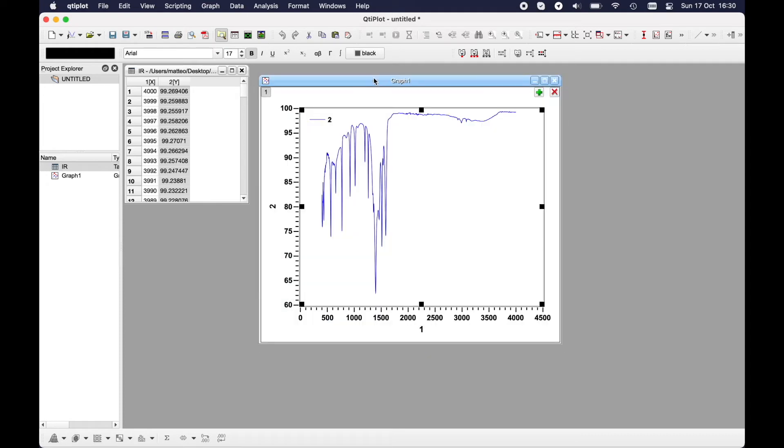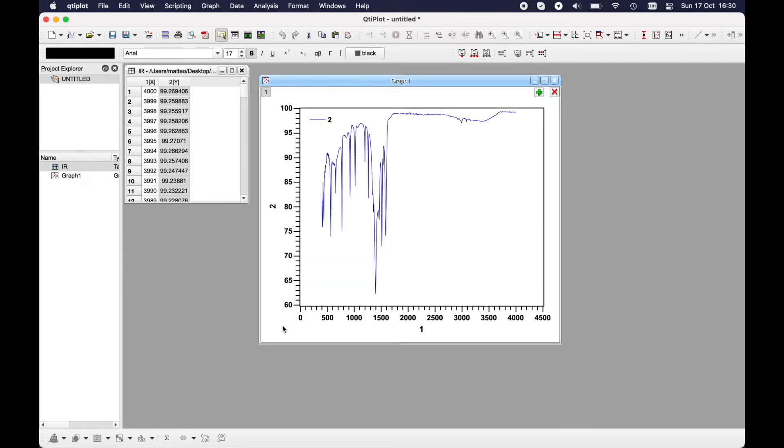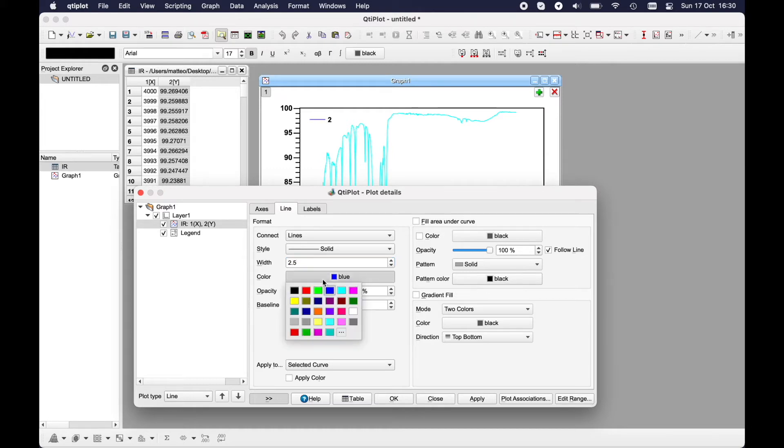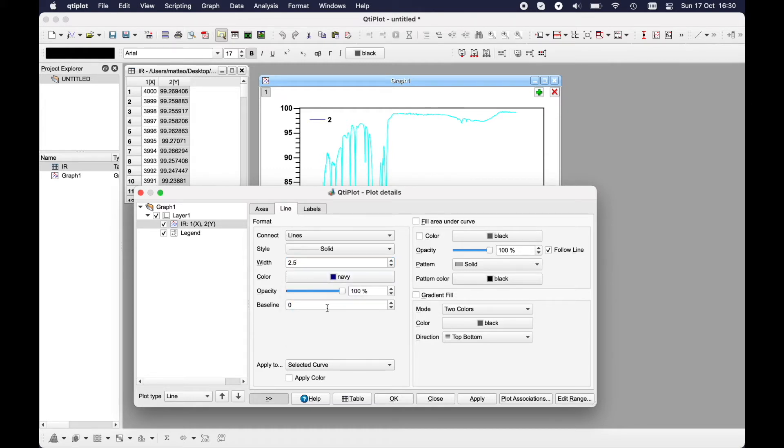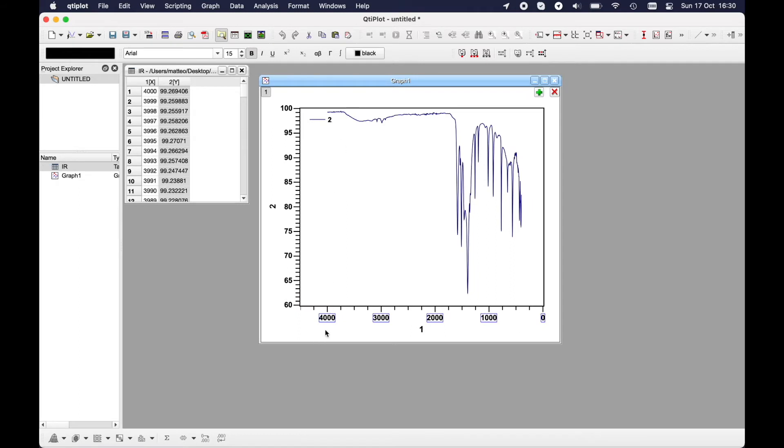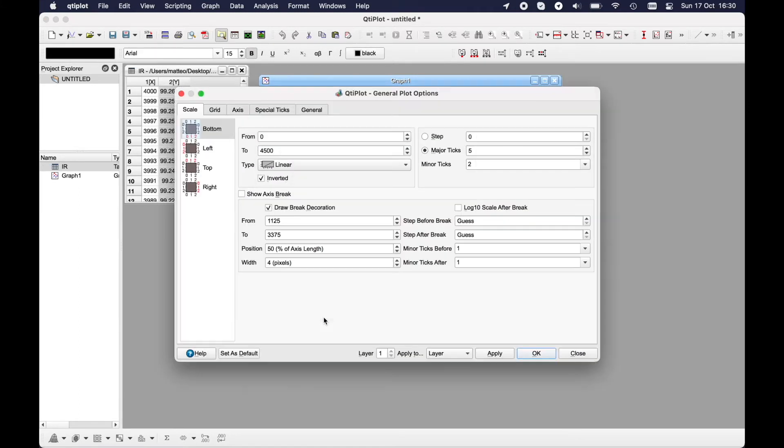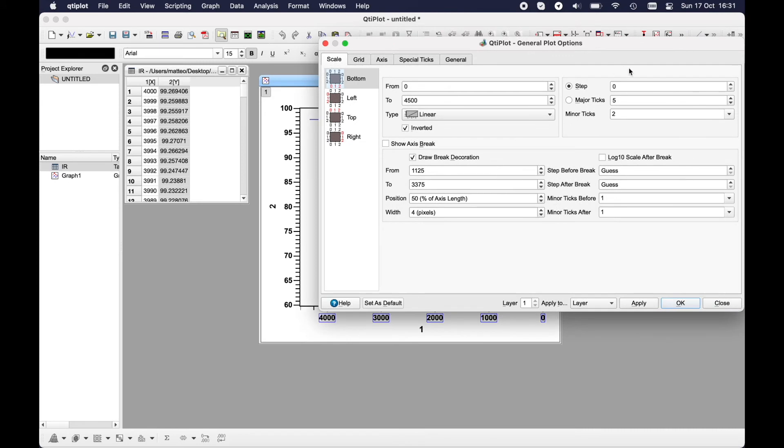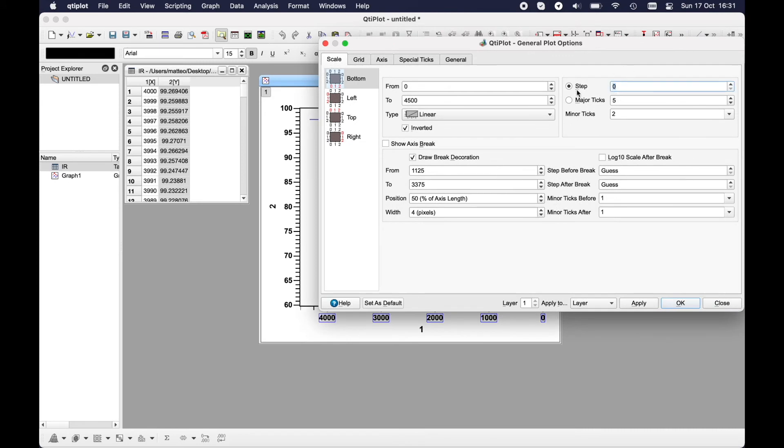So this is our IR plot. To modify it, you just have to double click on the line. You can modify however you like. For example, I would like to modify the width and the color. Let's put the color navy. The axis, the bottom axis, I would like to show it inverted. Okay, now it's much better from 4000 to zero.